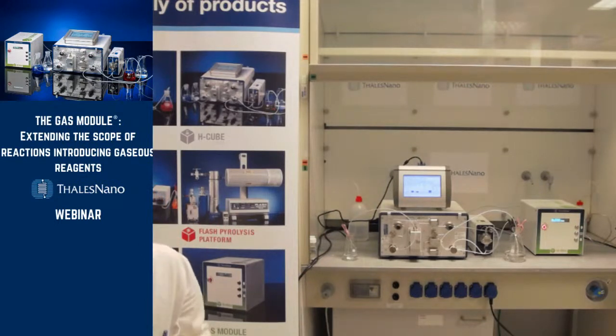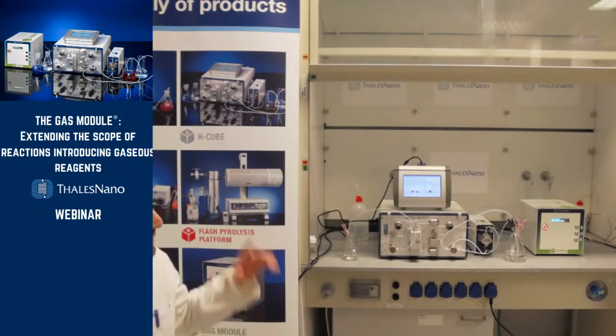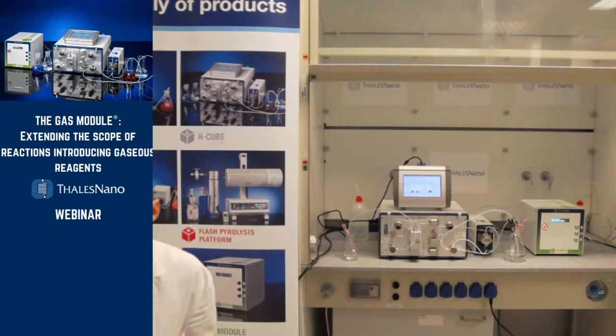If you are combining only the Phoenix with the gas module, you would need a control module in order to manage both of them and centralize the control. But you can also control directly from the H-Cube Pro if you have the three instruments, a Phoenix, H-Cube Pro, and a gas module. You can control all of them directly from the interface of the H-Cube Pro.